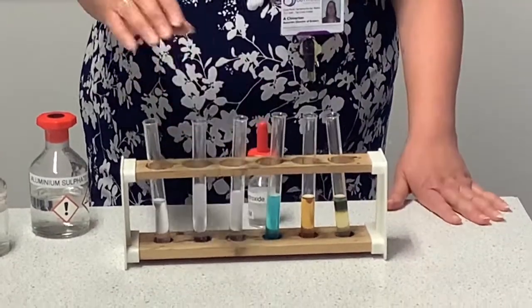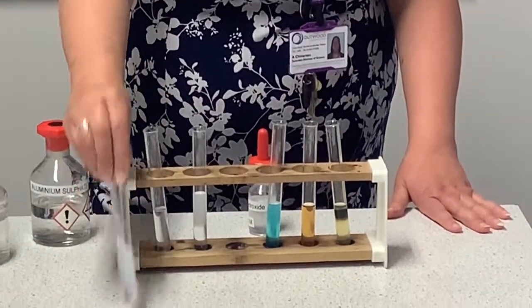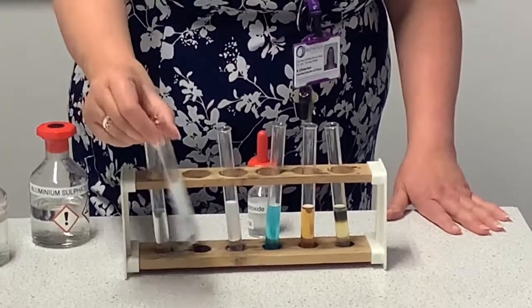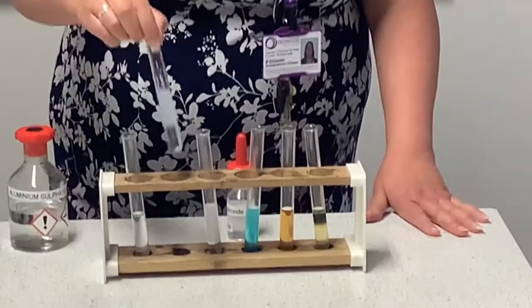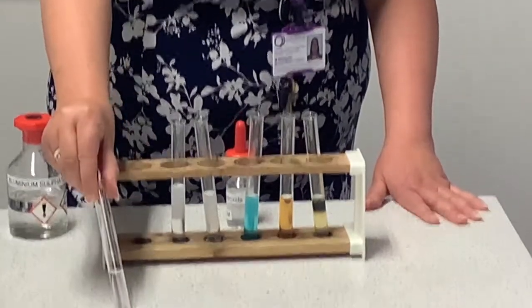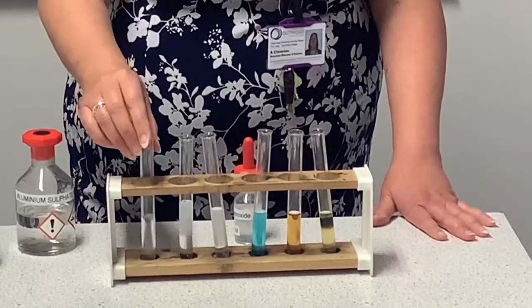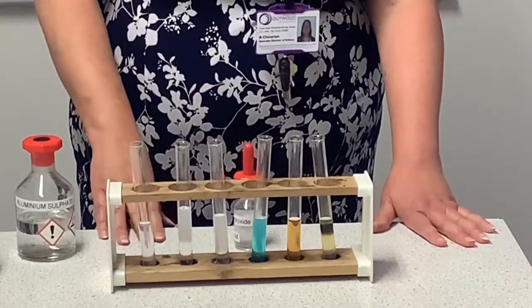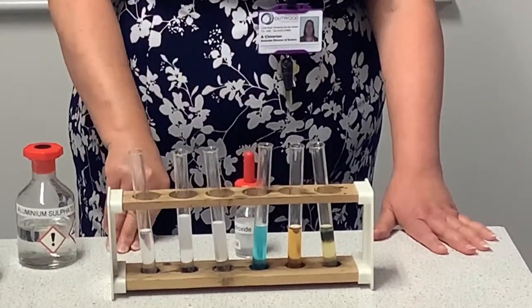So looking back at these again, we're looking at the magnesium, we've added additional sodium hydroxide to it, and we can still see that that precipitate is clearly there. With the calcium, again, we can still see that the precipitate is clearly there. However, with the aluminium, when we've added excess of the sodium hydroxide, then the precipitate has disappeared. So that is our way of identifying our aluminium ions. And to differentiate between the magnesium and the calcium, you could go back and do a flame test, which would give you the clear red colour for the flame test for calcium.